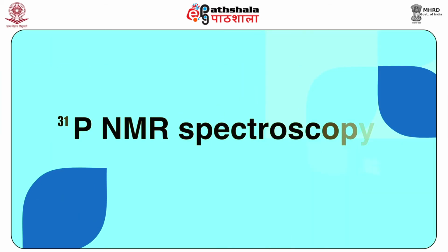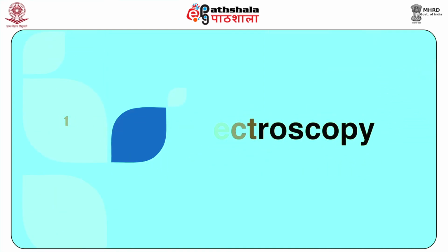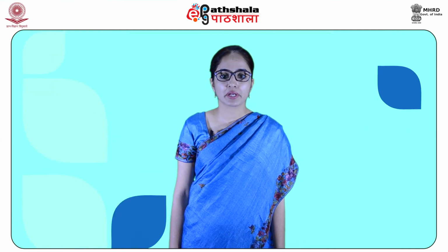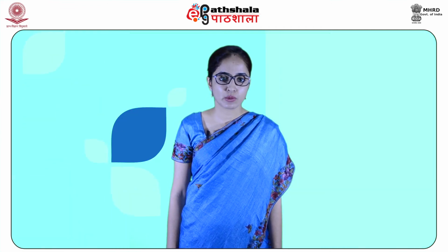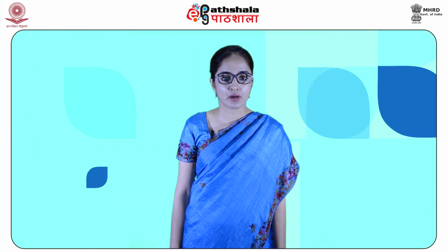Now students, we shall consider the NMR spectroscopy of 31 phosphorus. Phosphorus-31 NMR spectroscopy is used to identify phosphorus containing organic and inorganic compounds. It is commonly found in organic compounds and coordination complexes.